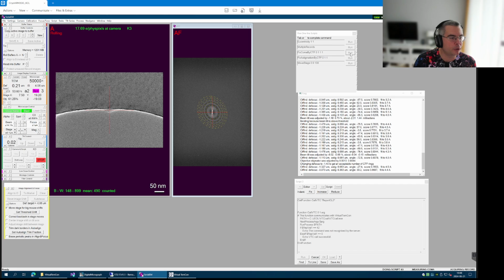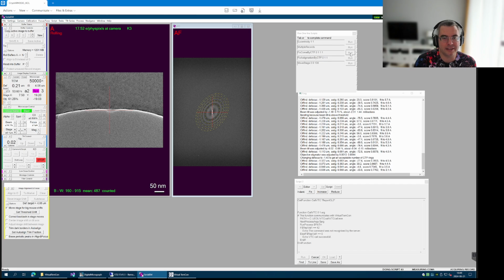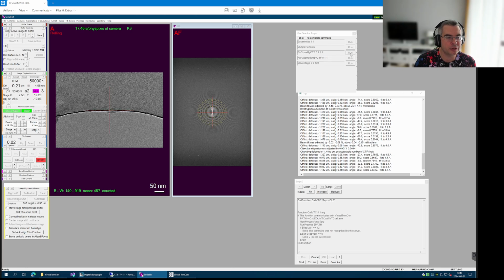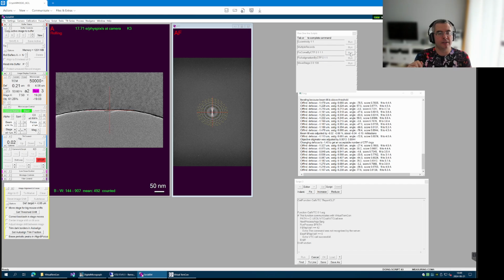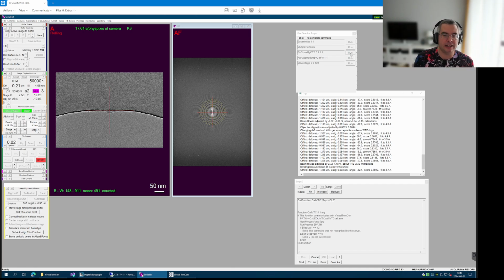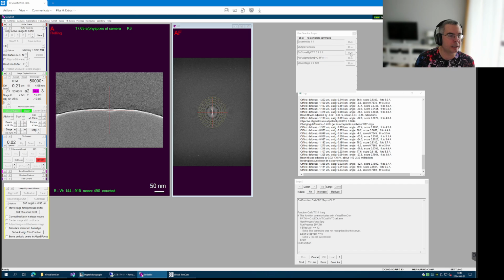We will see how good or bad this cryo-arm is at angle 2. Well, for now we are getting somewhat okay FFTs, so fingers crossed. But if that failed for any reason, I would have to use the HT wobbler and adjust the beam tilt manually at this image shift. So at hole 1, image shifted, I would turn on the HT wobbler and adjust the beam tilt if SerialEM was unable to measure it. But for now, it works okay.